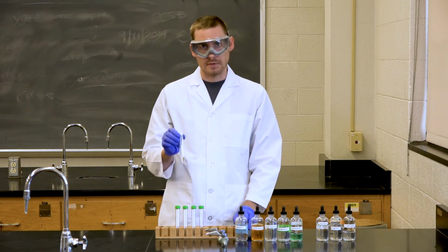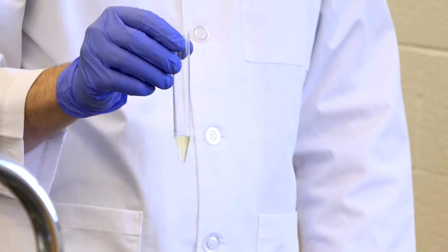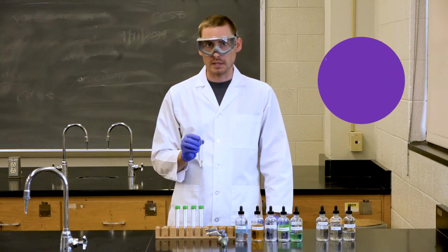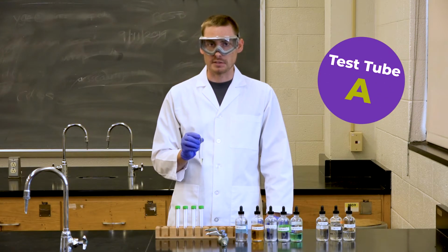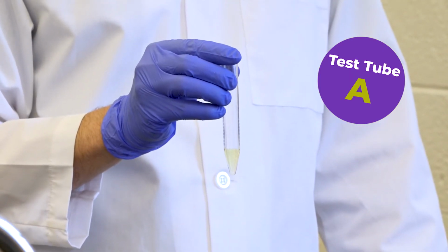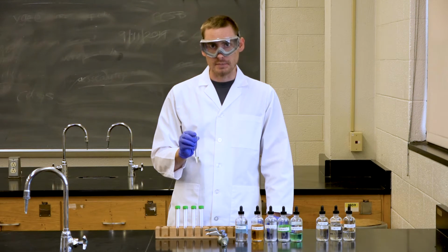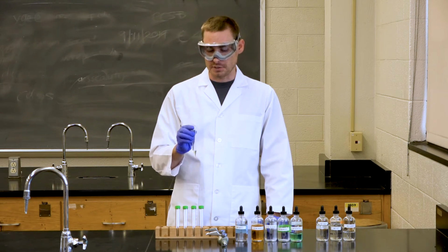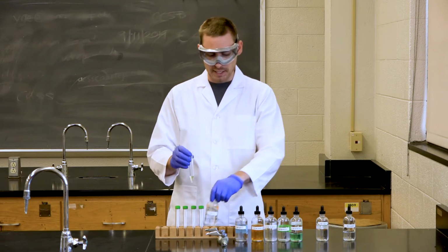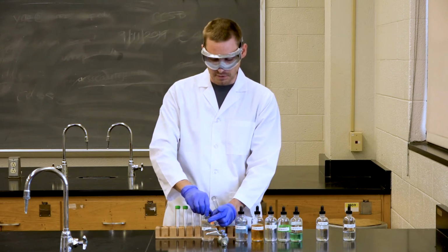After you've finished adding each of the 5 solutions, you will have about 1 to 2 milliliters of solution in your mixture. So you'll want to label this test tube as A. This will help you keep things in order as you separate the liquids from the solids into 5 separate test tubes. So the first step, as you follow your flowchart on page 268, is to add 1 to 2 drops of hydrochloric acid to this test tube.